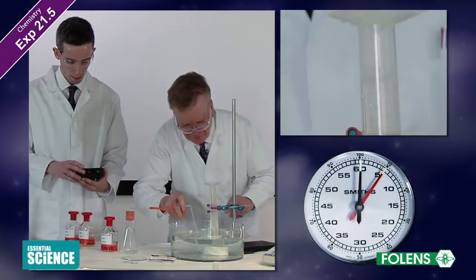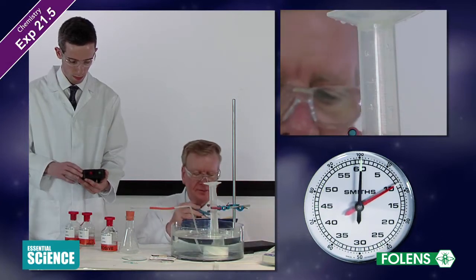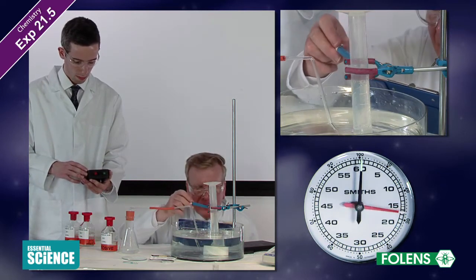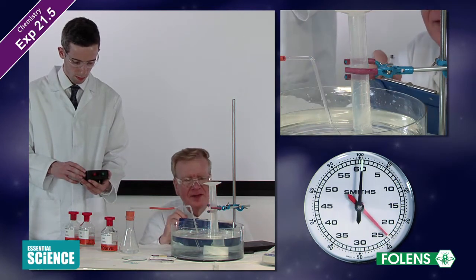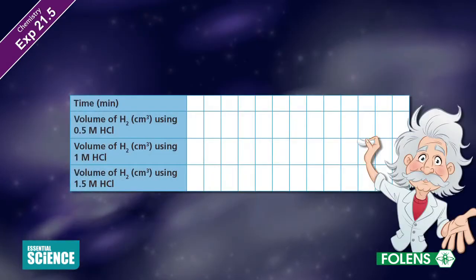Five seconds. 10 seconds. 15 seconds. 20 seconds. 25 seconds. When the reaction is over, note the final volume of hydrogen collected.